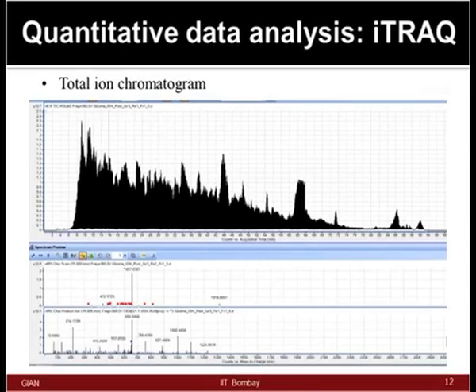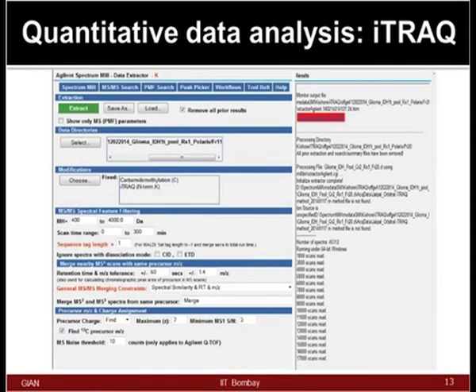In that way coverage becomes very important, and to do that people follow this strategy in the iTRAQ based workflow. You can see the MS ion, like if you just pass through, you will see a certain MS fragmentation pattern. If you do MS/MS, now you can generate the reporter ions which could be used for the quantification. While I will not talk in much detail right now about the parameters, there are various platforms available for doing data analysis for iTRAQ.